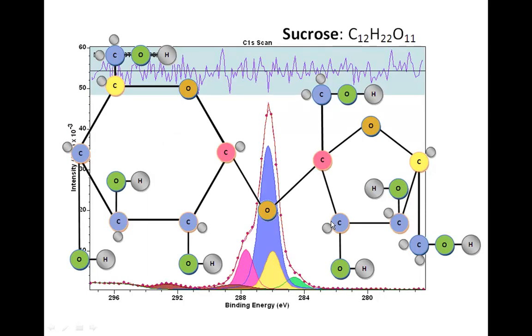Before looking at how we create curves from data, it's worth considering how we go about fitting a peak model to data. The same logic that is used to fit a peak model is inside the logic that we will use to create the line shapes. The difference is that we make assumptions in the case of a nonlinear optimization using bell-shaped curves. We assume that we have some understanding of what line shapes ought to look like. So in this case we've got a sample that is sucrose, and I'm going to use this to illustrate how to calculate curves from sucrose data.